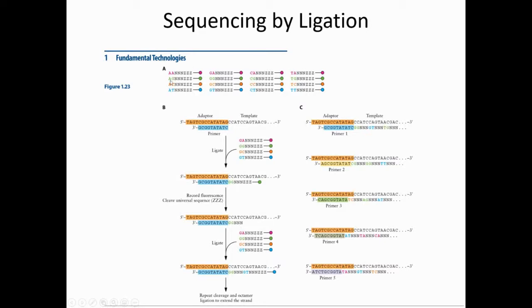So you have the first 2, that's the 3' end query sequence. These are different, and then these are all the same. And then each of these will carry a different fluorescence signal. Okay, they have different signals.